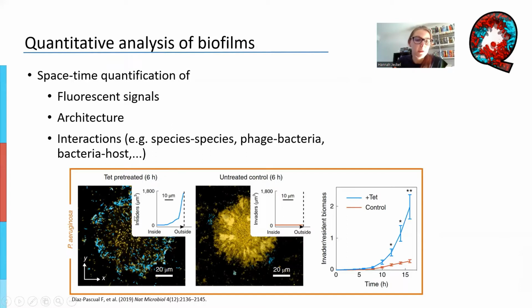And the cells were previously treated with antibiotics, which is why they're so sparse here. And we could see basically that the cells predominantly exist in the outer region of this previous biofilm. So you can see in what areas these invading cells accumulate, as an example.